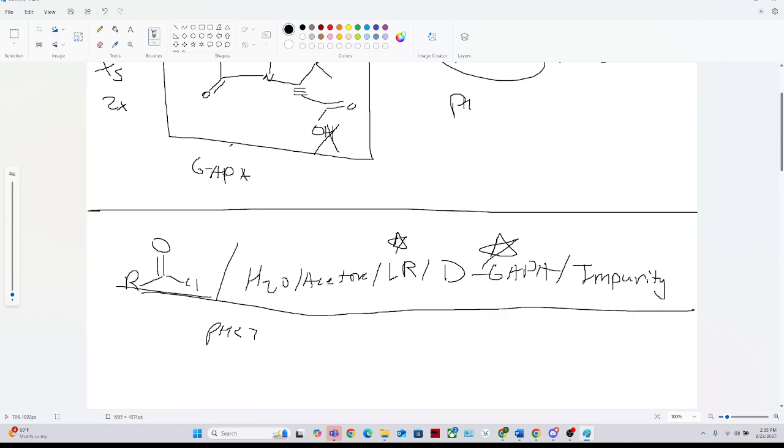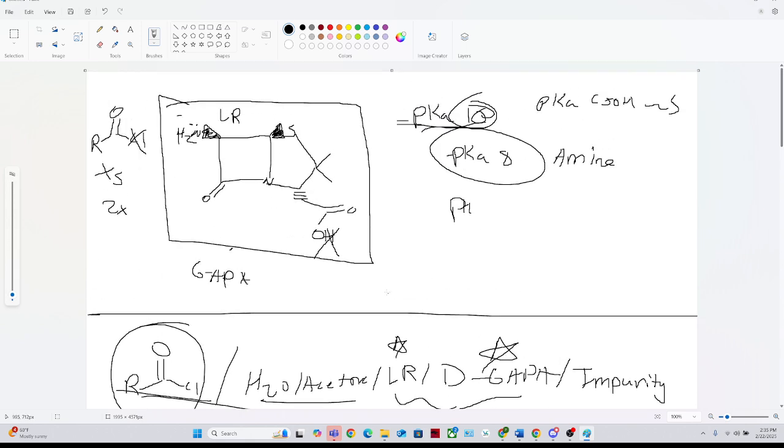Again, water and acetone, don't worry about that, but your acyl chloride, the excess reagent, is still also in your solution, and that itself is going to be nonpolar, okay? Just from the things that have been listed. So, if I know that these two guys are soluble in my aqueous, because they're salts, and my acyl chloride is actually nonpolar, I have water and acetone, so effectively I just have a mixed polarity solvent, and I have an impurity, and that impurity, by the way, is just going to have this guy cleaved right here.